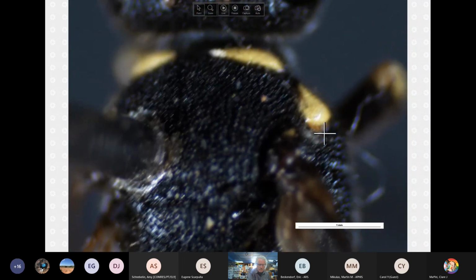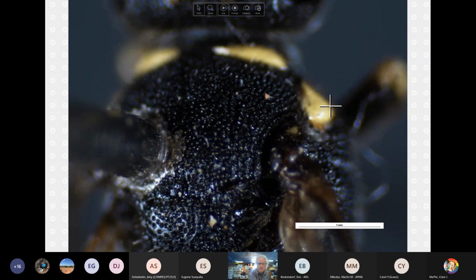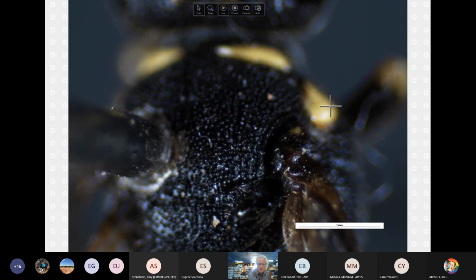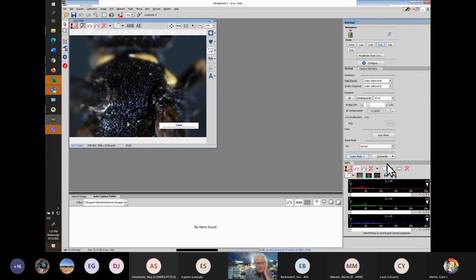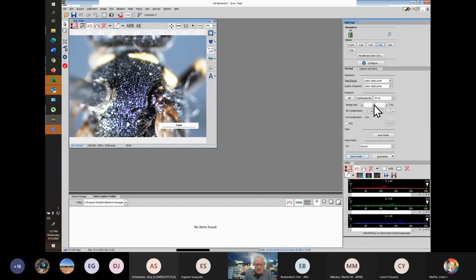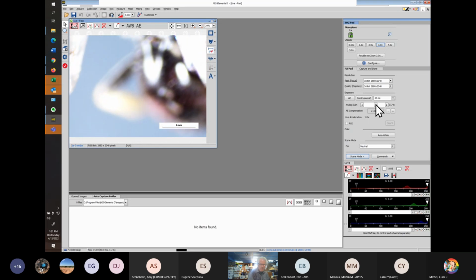So you can see in this one, both the pronotal collar and the pronotal lobe are bright yellow. You also see specimens that are white or bright white, and that's often species specific, but every once in a while you will get some of the normally yellow ones turning whitish, particularly the modestus group that scares everybody. All right, I'm just going to jack up the lighting for now. That will burn out a lot of things, but hopefully make the picture a little bit better.